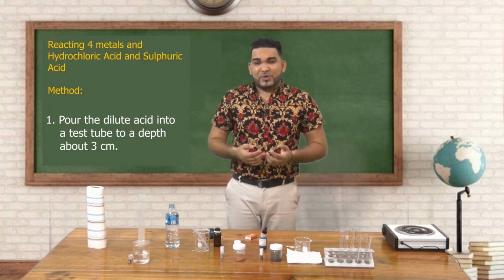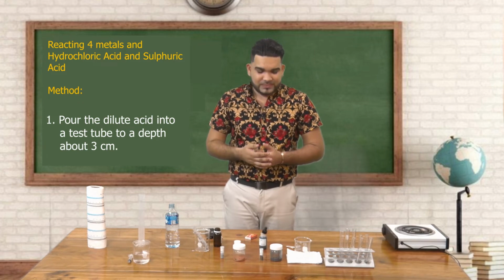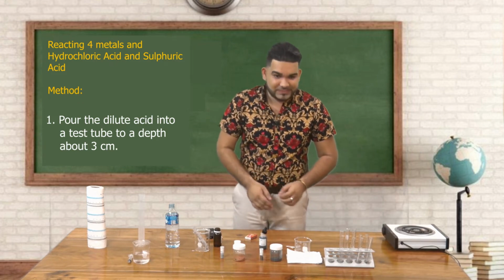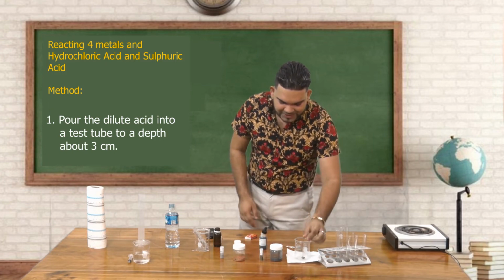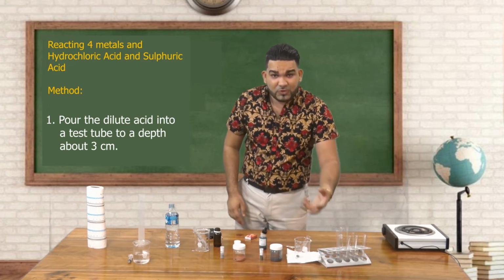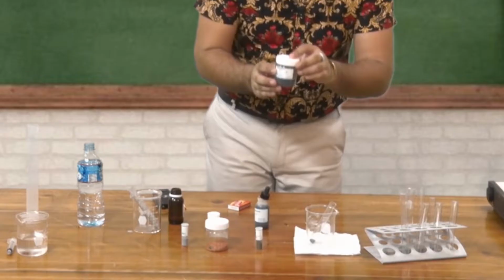Now, after that, we will be observing carefully what happens after that reaction takes place. So let's get straight into it. I will place it into my beaker here for you to get a better view of what is happening. So I have here my first metal, magnesium.